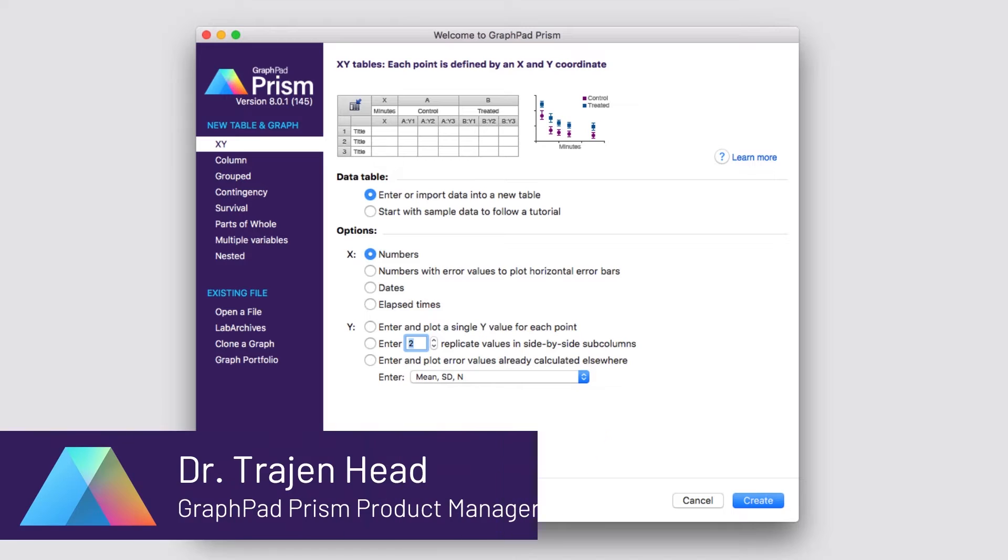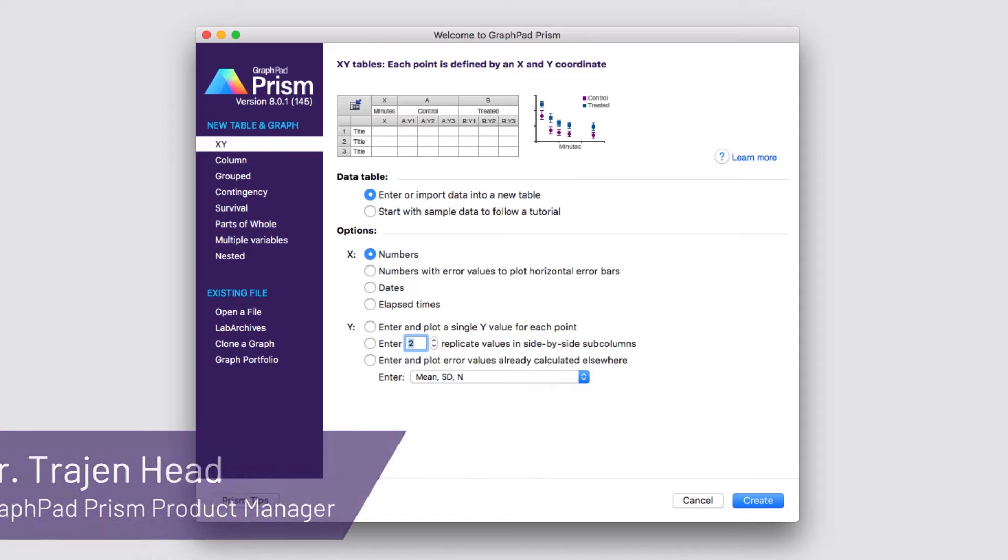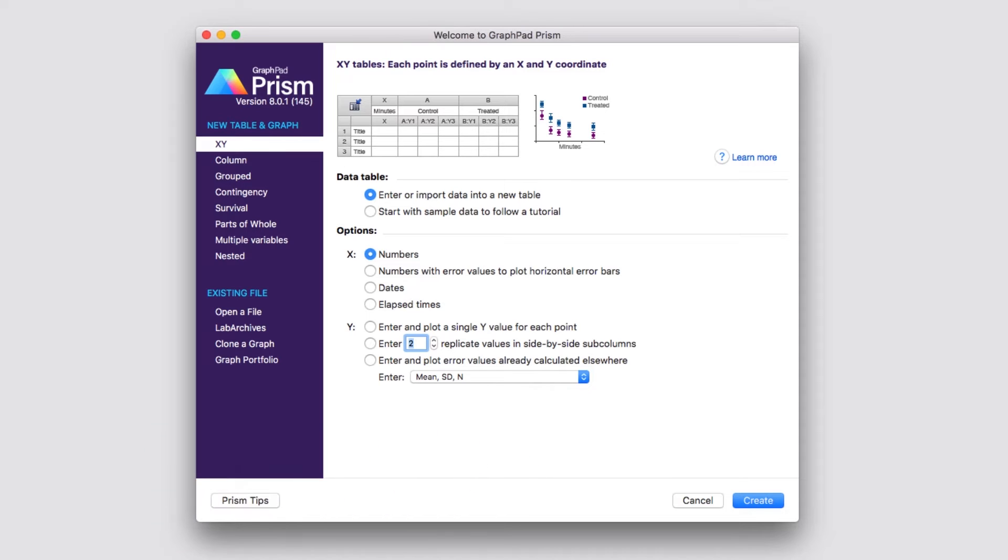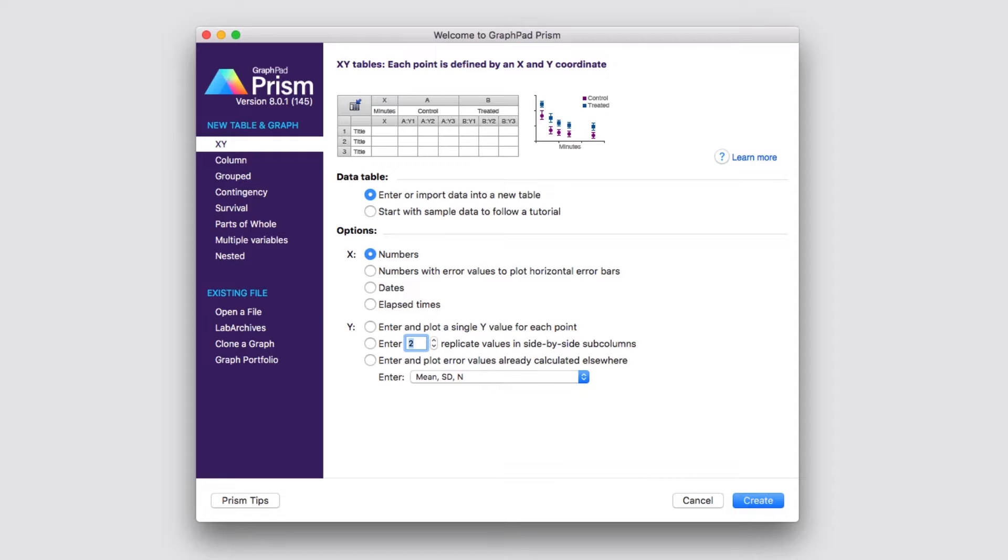Hello and welcome. My name is Dr. Trajan Head, and I'm the Product Manager for Prism at GraphPad Software. In this video, I'm going to give you a brief tour of Prism and introduce you to a number of basic features and concepts within the software that'll help you get up and running with your own data to perform some basic analyses and generate some graphs. So let's get started.